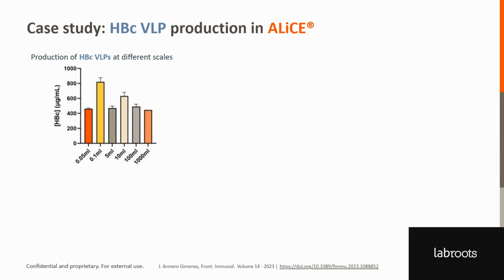So now in the first, we also take it from the microplate. There's our proof of concept expression, the electron micrograph that you saw earlier, using 50 microliter expression, but then also looking at different scales of the VLP production. So moving upwards from 50 microliter through the milliliter scale, using those standard Erlenmeyer shake flasks, all the way up to the bioreactor scale. This is a 1 liter reaction, again in the Celltainer CT20 device. And we could see that the yield of our protein was really the same across all of these different scales, this lossless scalability, which is really great to show for a protein that's not just a reference protein.